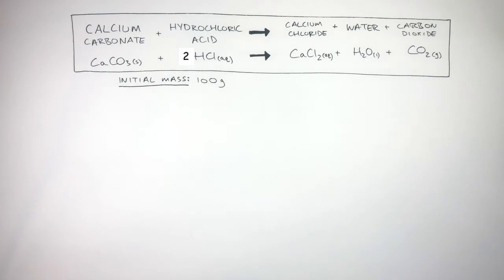In this video, we're going to understand how and why the final mass changes and how we can use this to understand the rate of reaction between these two reactants.